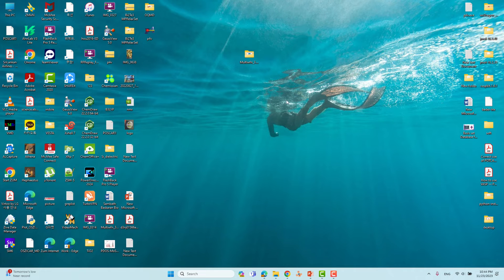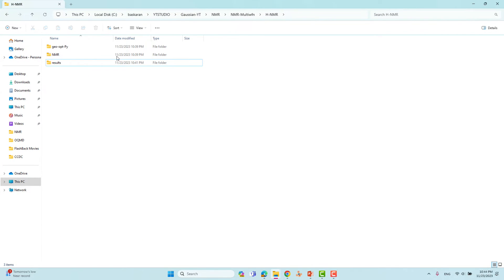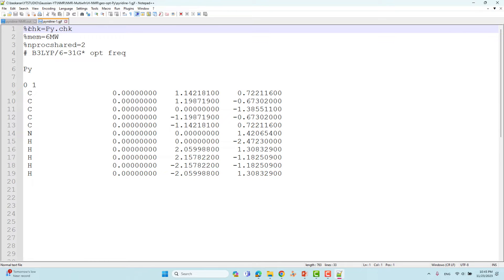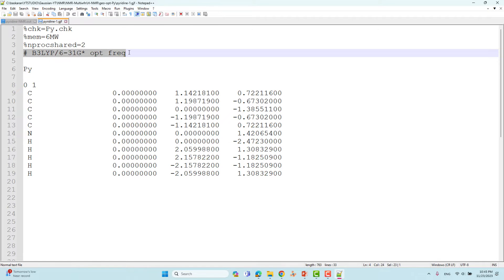We will look at our input and output files. First you have to go to your folder — you have to optimize your structure first, so this is the already optimized one. I will show you the input file for geometry optimization. You have to put %chk equal to py.chk, memory 6MW, and nproc 2. The route section uses theory B3LYP.